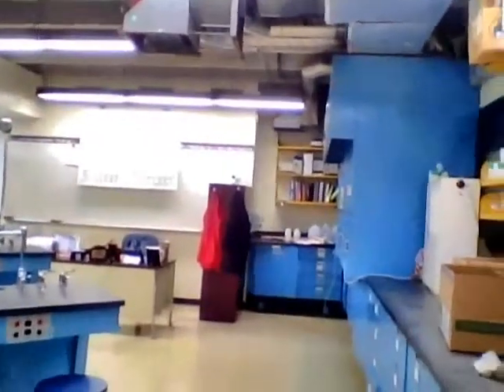Okay, we're going to take you on a tour of the room just in case you were absent when we went through this in class. This way you know where all the safety equipment is and features of the room. So right now I'm standing in the back right-hand corner of the room, so farthest away from the door to get in here.